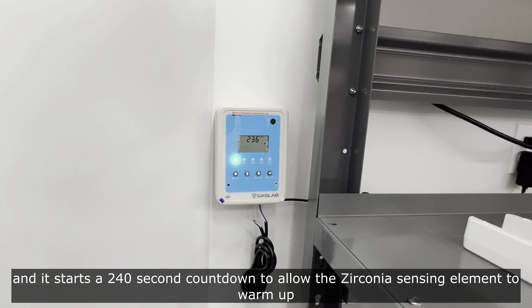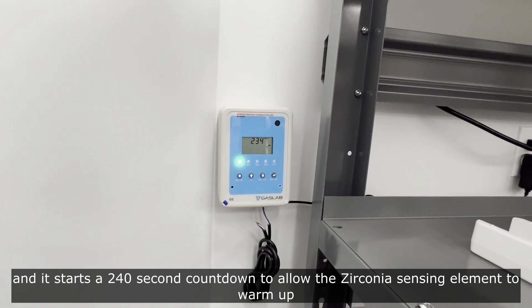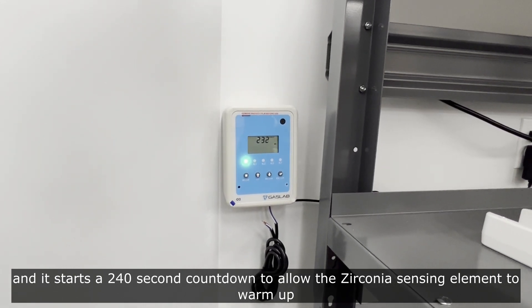Once plugged in, it starts a 240-second countdown to allow the zirconia sensing element to warm up.